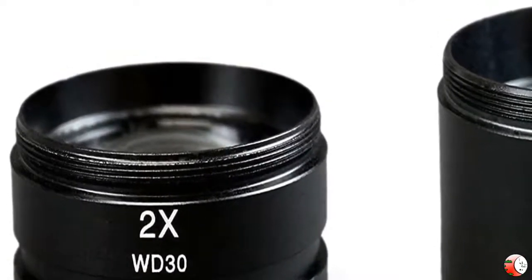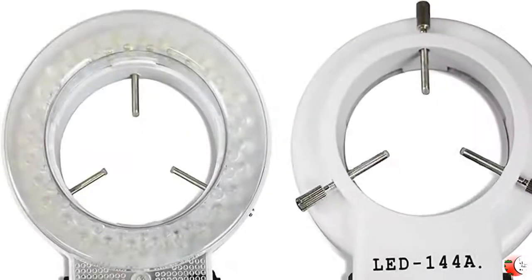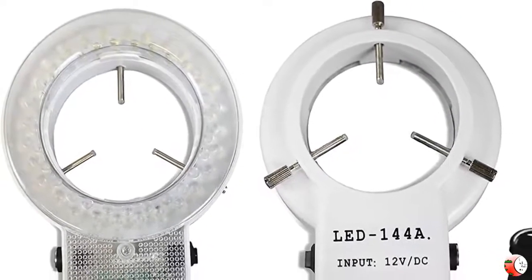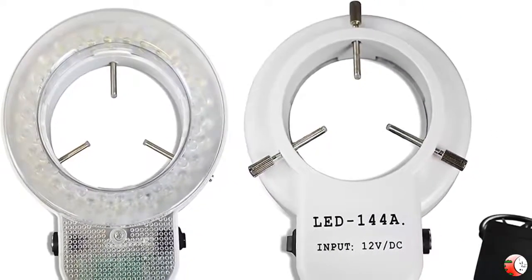Both ocular tubes are equipped with a plus/minus 6 diopter adjustable to compensate for eye strength difference when needed.